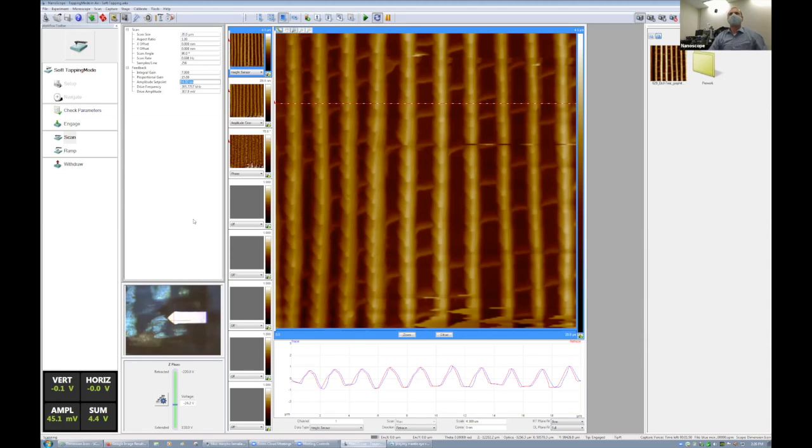Whereas the other wing, frankly, we don't really know too much about that particular wing because it was just some random wing that we got sent to play around with. But we wanted to show it just for contrast. I think because it's so big and then so small, the shape and structure doesn't have the sort of Goldilocks just right fit for it to emit that blue color.